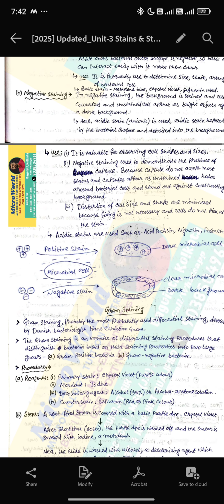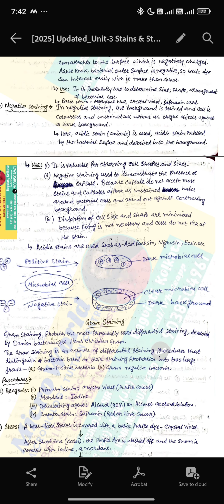So, students, tomorrow is your practical exam, and I think from my side there is a high chance of negative staining. Okay. So, please, please, I'm going to now help you understand the principle of negative staining, understand that for God's sake, and throw that in your copy tomorrow. You will get 4 practical marks.